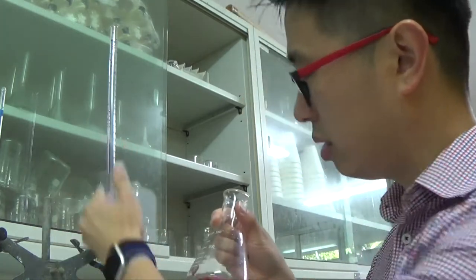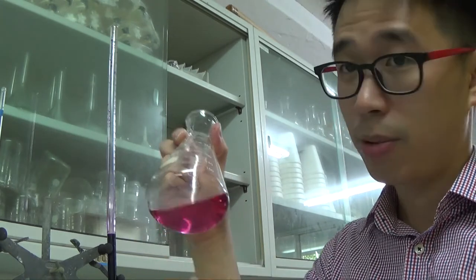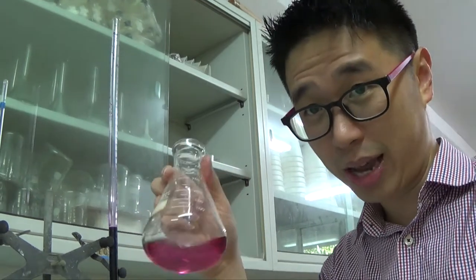One drop of this gives you a very slight pink. So you know this is a very intense color. So one extra drop gives you a very slight pink. This is quite intense pink already, because I have quite a lot of it, right? So what happens if I keep on adding, right?